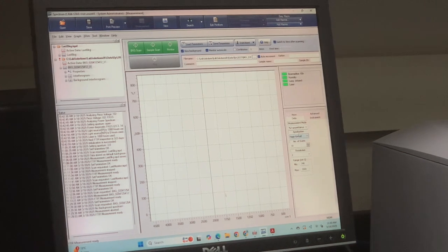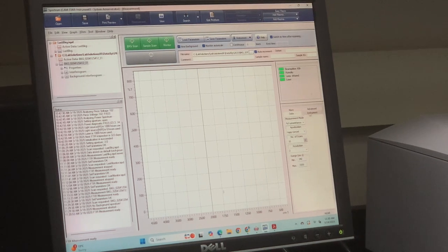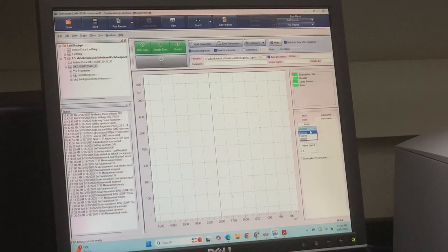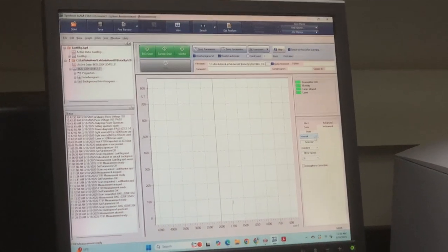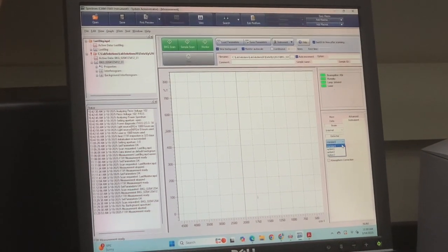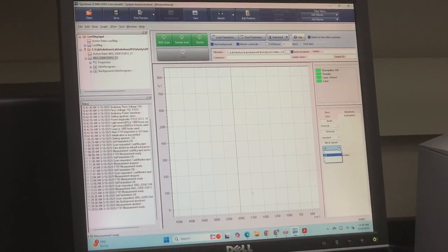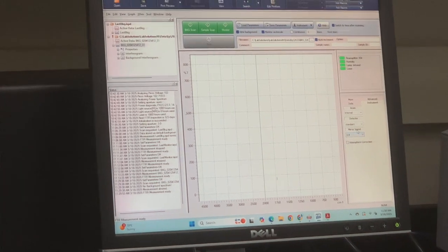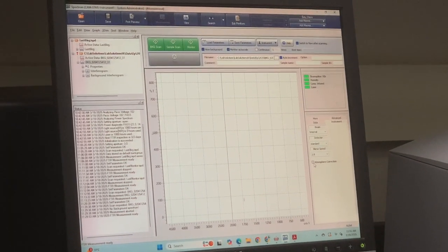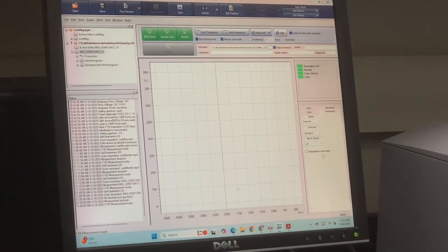So let's look into the parameters more. We do have the data tab, we've done that. Then there's the instrument tab. You mostly just use the internal detector. If you had additional detectors, like when you install the ISR, you'll be able to select that. Mirror speed is how fast the mirror is moving as it goes through the wavelengths, and atmosphere correction. I don't know why the mirror is moving.